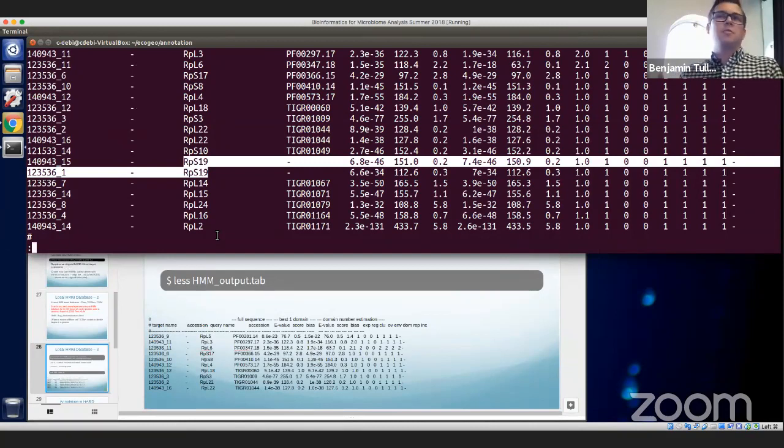And that's troubling. But if you remember back when I was giving you some of the statistics about this particular genome, we believe it's about 2.4% contaminated. And so these marker proteins here that have duplicates are probably the result of that little bit of contamination. So it would be something to go back in, maybe with anvi'o, and make some adjustments to that genome and make it a little cleaner so that this works.